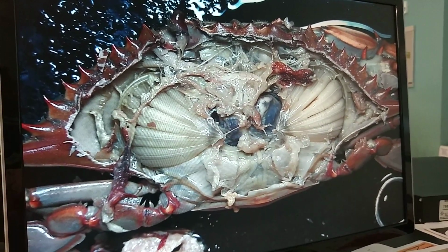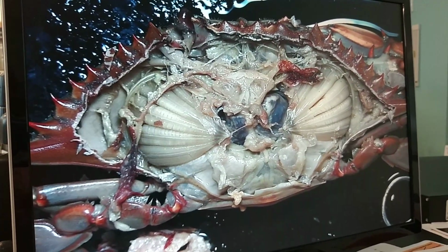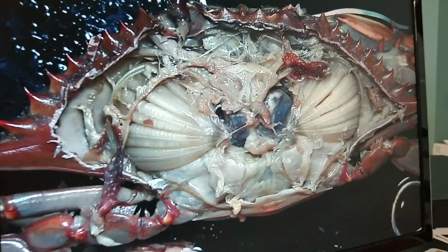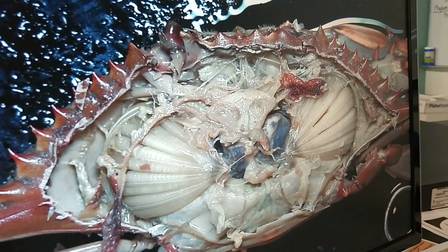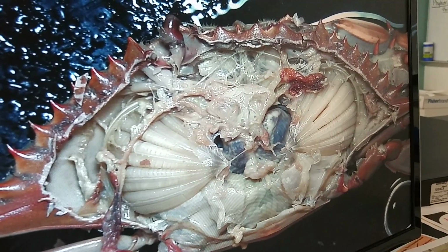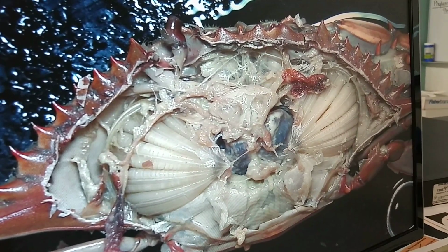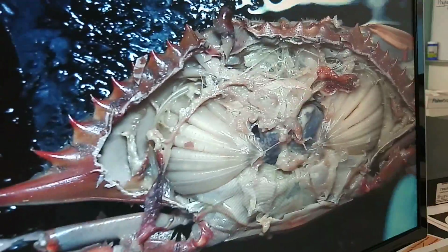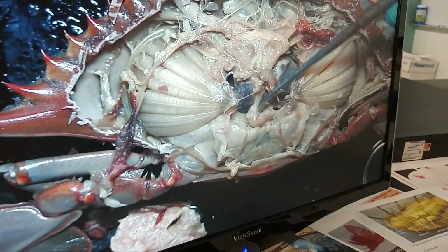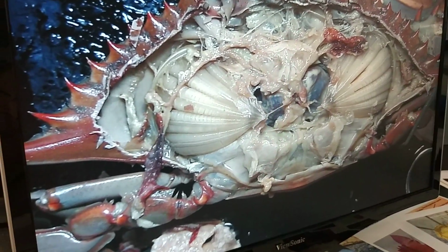You guys know that as biologists, right? If you think about it, a larger egg with multiple sperm hitting it means more chances of it being fertilized, right? That's general basic biology, true for anything that has dioecious species, right? Yes? Okay. So internally, you can see how fragile the heart is, and that's why it was hard for a lot of you guys to see that.